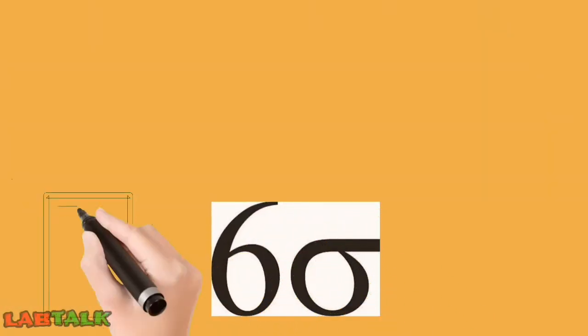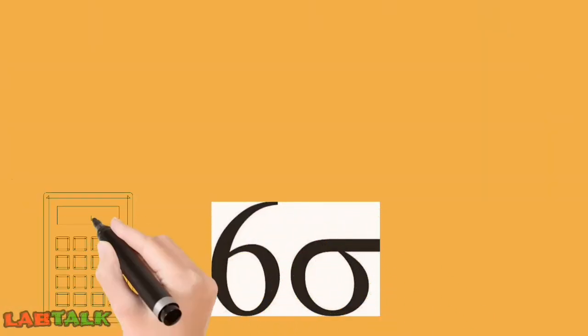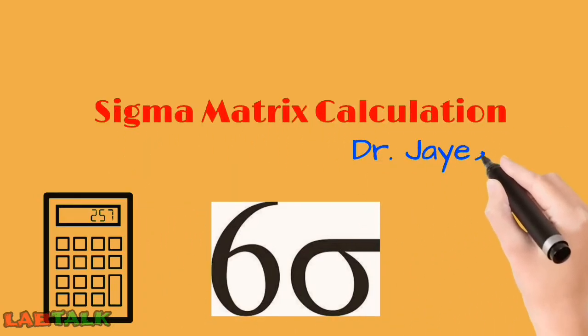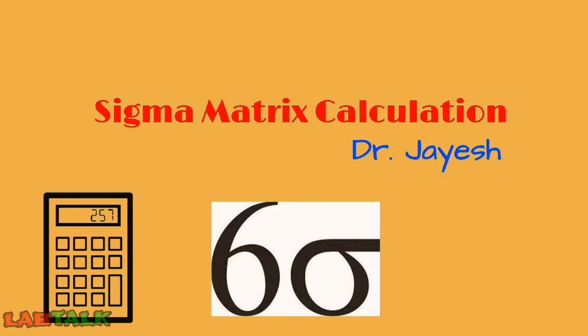To see how to calculate Six Sigma metrics in internal quality control using the data which is already available in the laboratory. Example of process improvement for clinical laboratory. We will see the same example again. So first of all, you need to select the analyte for which we need to find out the current process of Six Sigma and the target scale of Six Sigma.